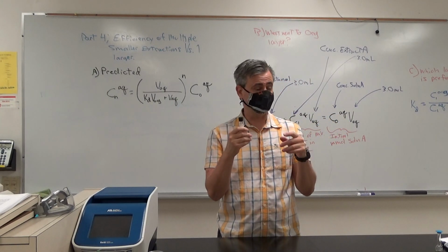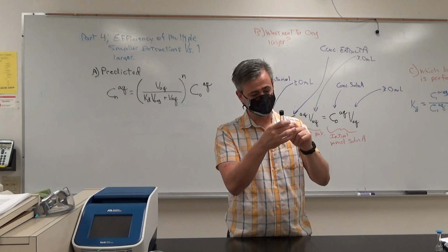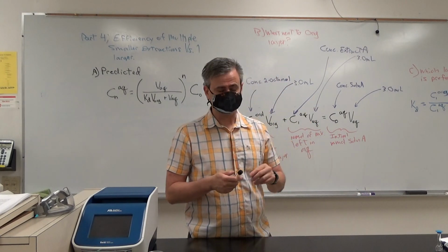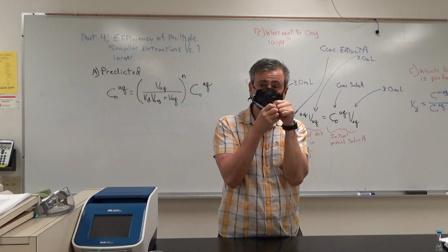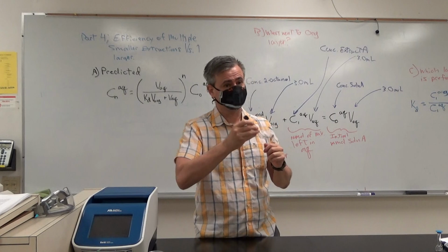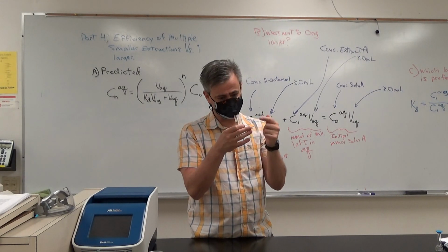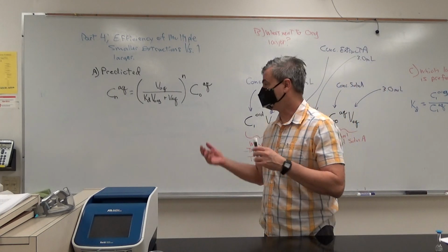This time, before you remove the bottom layer, you put a disposable pipette down to the bottom and remove the bottom layer. Now you're going to remove that top octanol and just put it aside. You don't need it. You didn't need the other octanol either. Then you're going to put in 1.5 mLs of fresh octanol and extract it again, and then centrifuge it again. Now you can take some of that bottom layer. Now you've extracted it 2 times, and you can see how much is left in there after 2 times. You can compare it to part 3 where you just did it 1 large time.